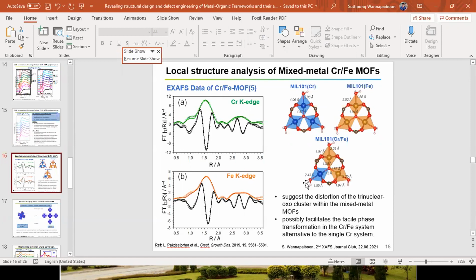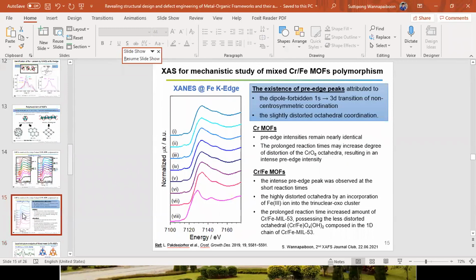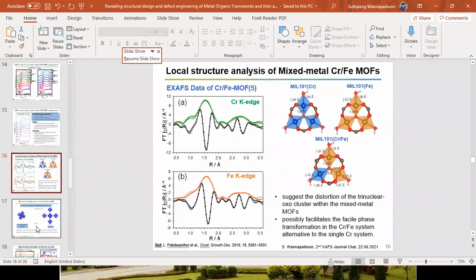May I add something? Please go to slide number 15. It shows the same shape for your iron 3+, right? Yes. To me, it looks very similar to iron in silica glass structure. So it is 3+. But from your X-ray data on slide number 16, the X-ray structure in R space shows the first shell, which is iron bonding to oxygen, right?